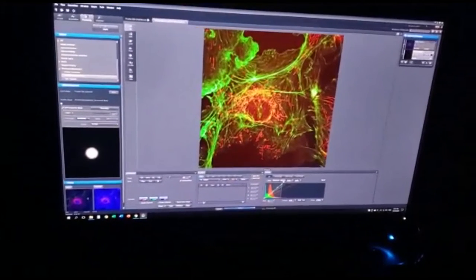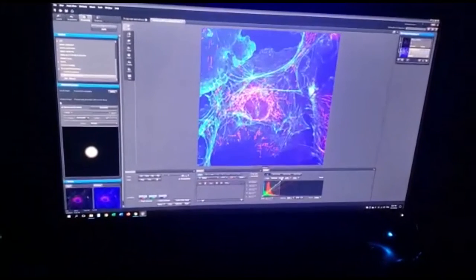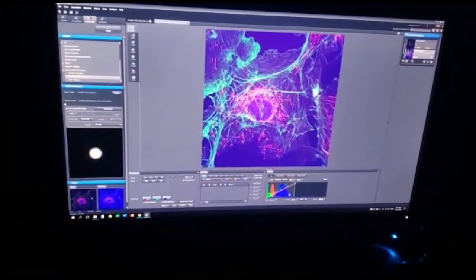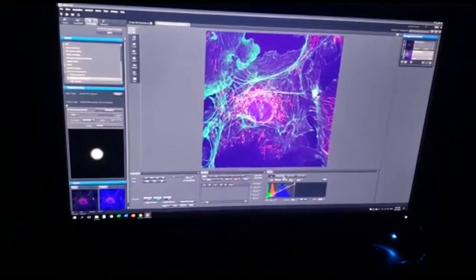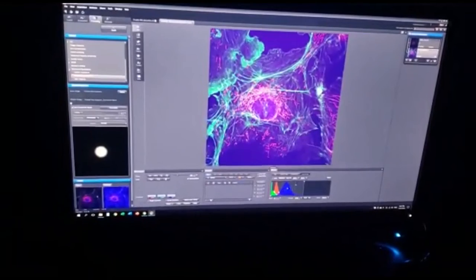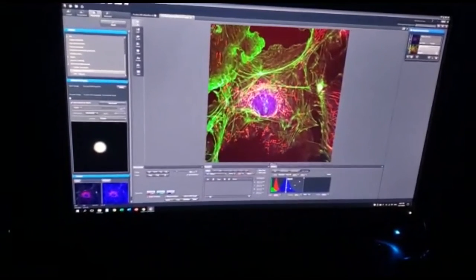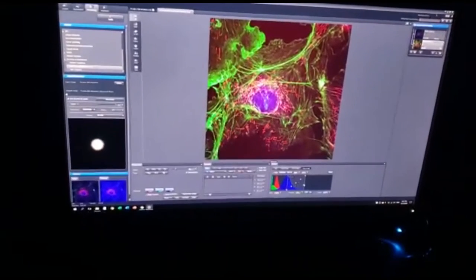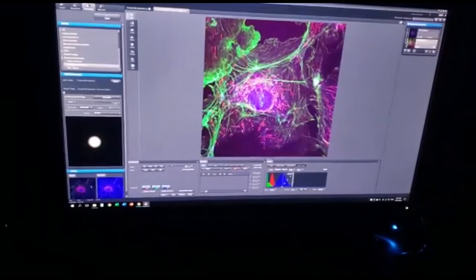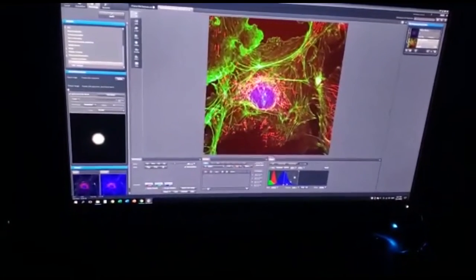We are able to make some adjustments inside the sample, because we know that the metadata that is obtained is big, so we want to make an image that is better. For example, we can choose one single channel and start to modulate the absorption or the emission depending on the color that we want to see.